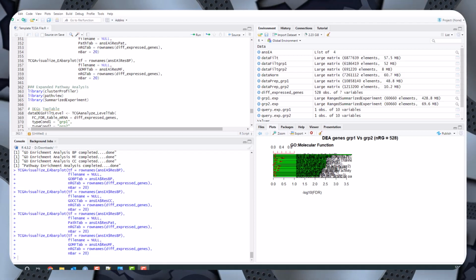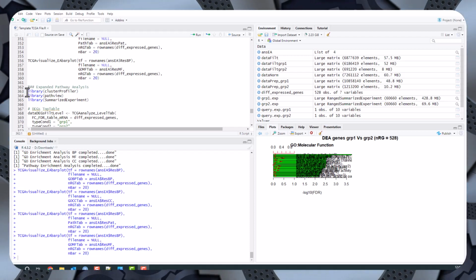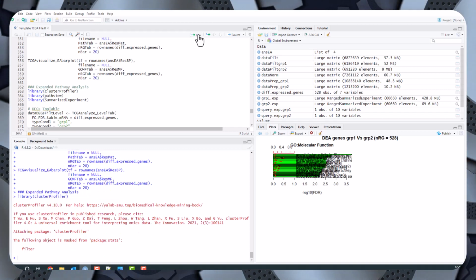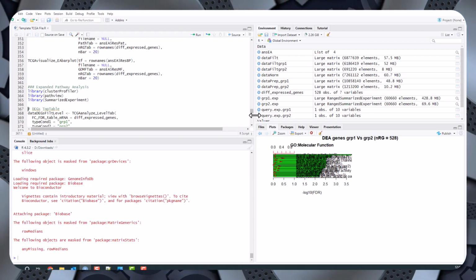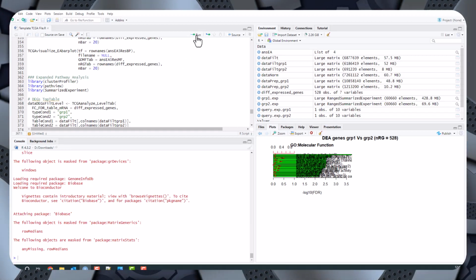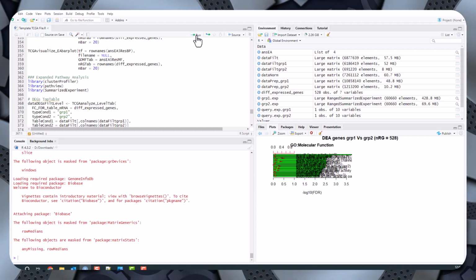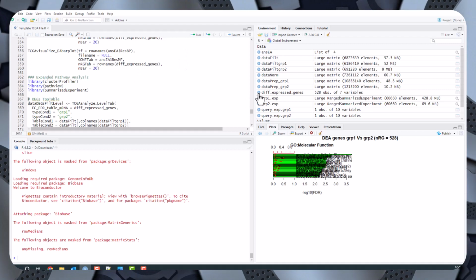The final part of the analysis is pathway analysis. To do this, first you need to install clusterProfiler, pathview and SummarizedExperiment as 3 different libraries. When you looked at the data to start with, all of the genes were named by Ensembl IDs. So what you need to do now is convert those onto Entrez IDs, which is what the next part of the code does. It filters through that list of differentially expressed genes and finds the new names.